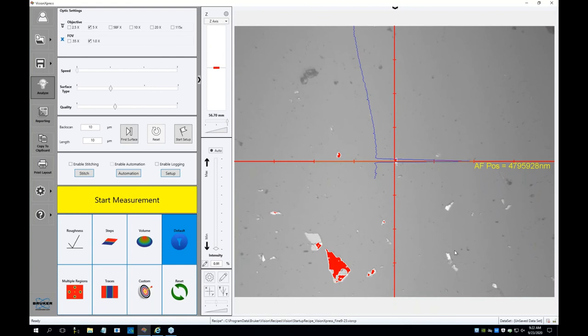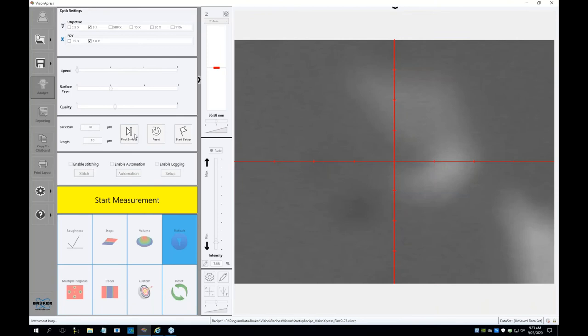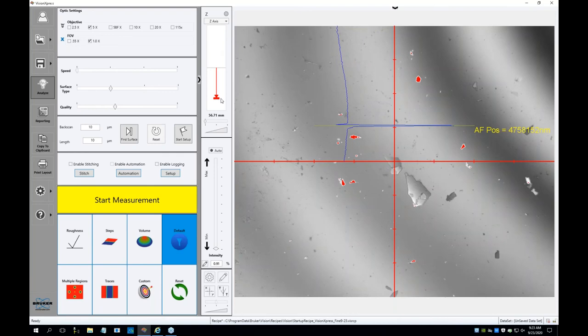And as I was mentioning already, the fact that we are using interferometric objectives really helps us to gain some contrast whenever we see the fringes. So now we can define a certain interesting graphene area. We can refocus on that specific location before jumping to a higher magnification and gaining lateral resolution. If we want to see the fringes here, we can readjust and see how big the contrast is in that case.